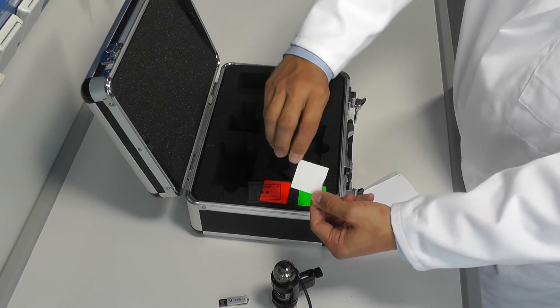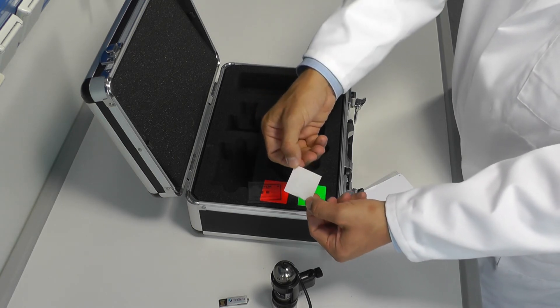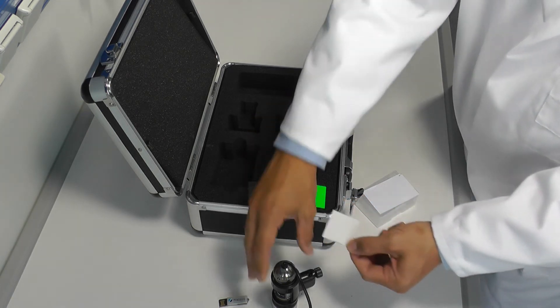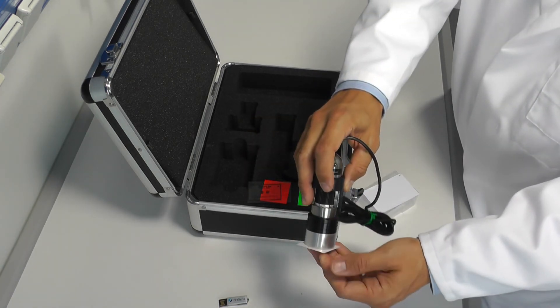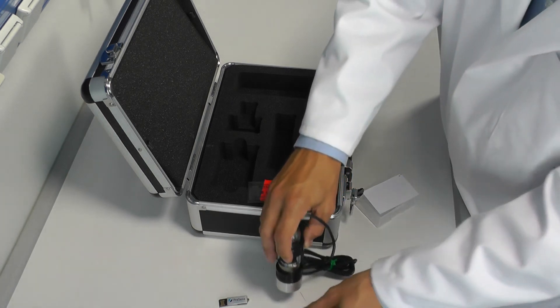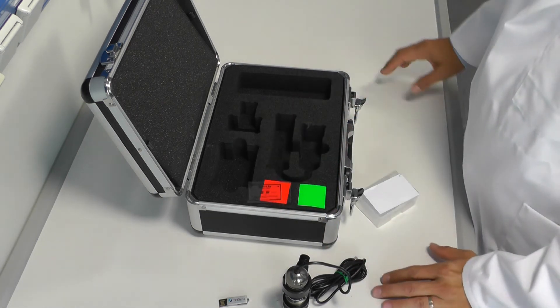An oxygen sensor foil has a dull white side and a glossy, slightly red side. The dull white side has to face the sample surface while the detector unit is aimed at the glossy side of the sensor foil for recording. So this is your new VCSend system for oxygen imaging.